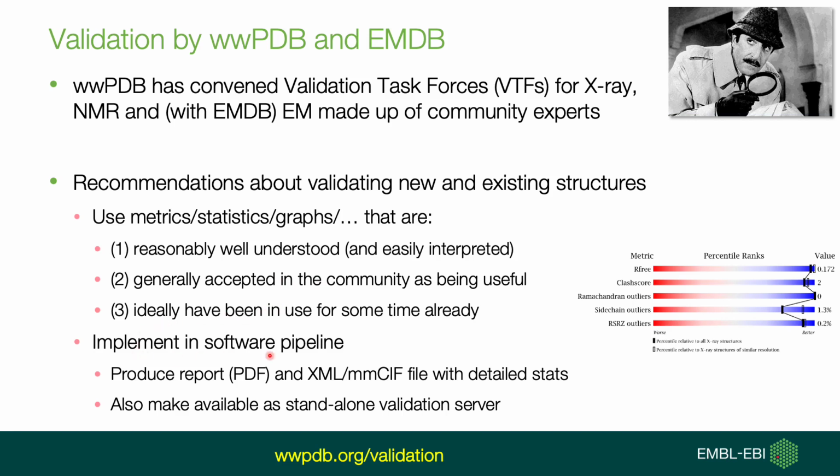Those metrics should be implemented in the software pipeline, and the software pipeline should produce a human-readable report, as well as a machine-readable file with all the details. And the software pipeline should also be made available as a validation server. So this is what has happened a number of years ago already.